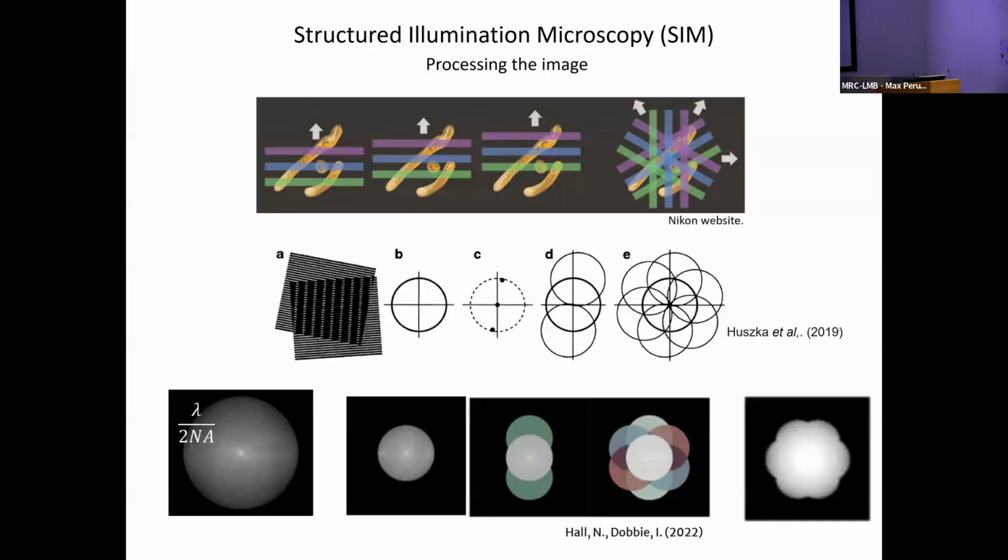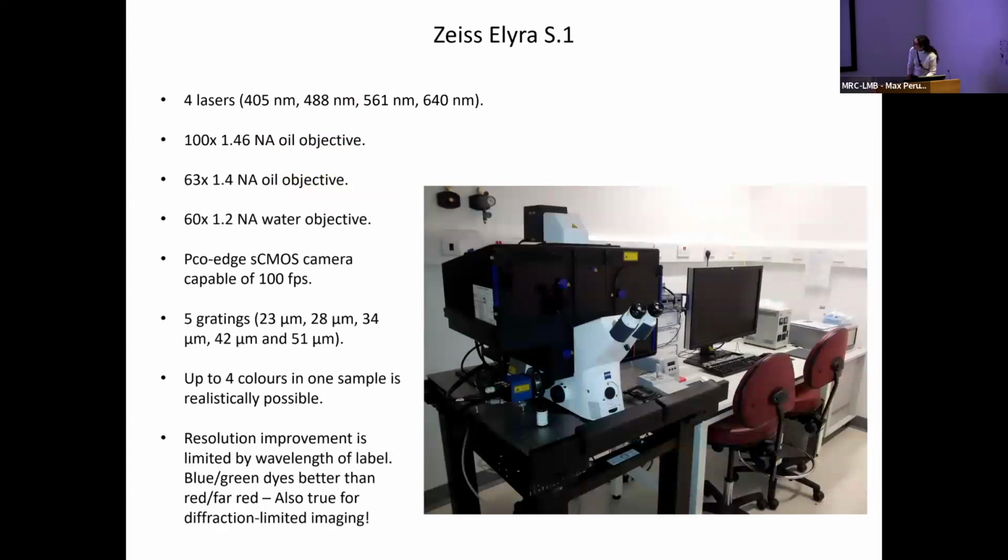And so in the Fourier space, you have more frequencies, which means more details. And this is a way to describe your data. So with an inverse Fourier transform, you can change that series of frequencies that describe your image into a series of pixels that describe your image again, but in a more visually appreciable way. So that's how SIM works.